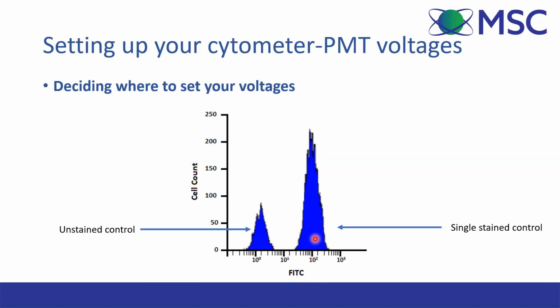But you need to remember, once you set the voltages, they must remain the same for every tube in the whole experiment. Otherwise, your data will not be valid.